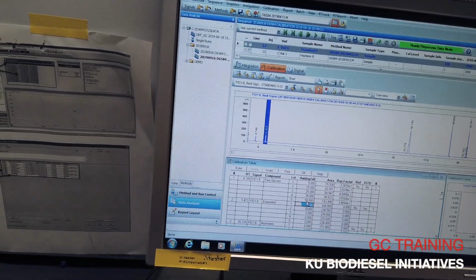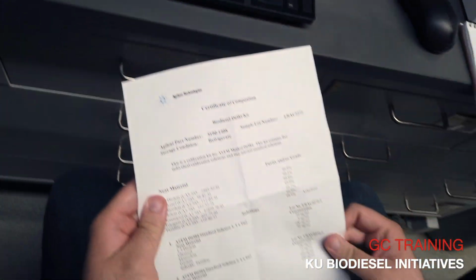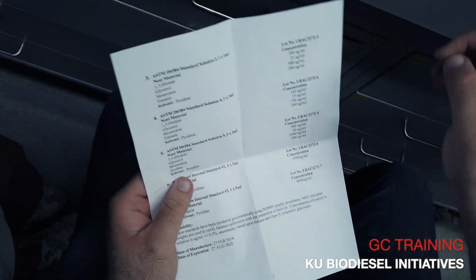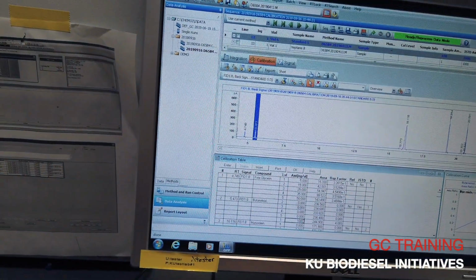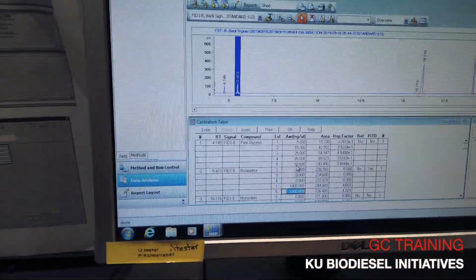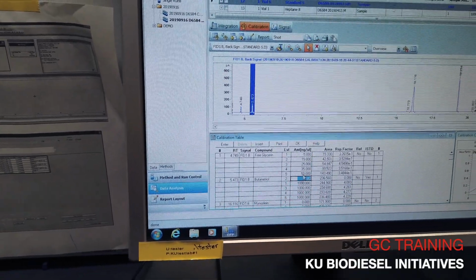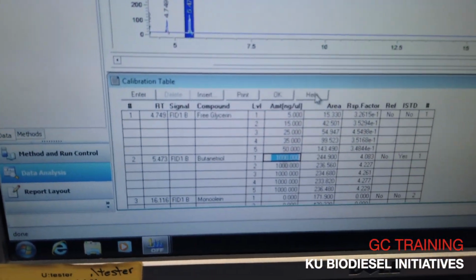Oh, I guess we need to do this one too. So the internal standards are, why doesn't it have it listed? 1,000 and 8,000. So I'm just gonna do that. Once we get the numbers in here, then we can worry about order of magnitude, because you can either put this as like 0.1 or, yeah.